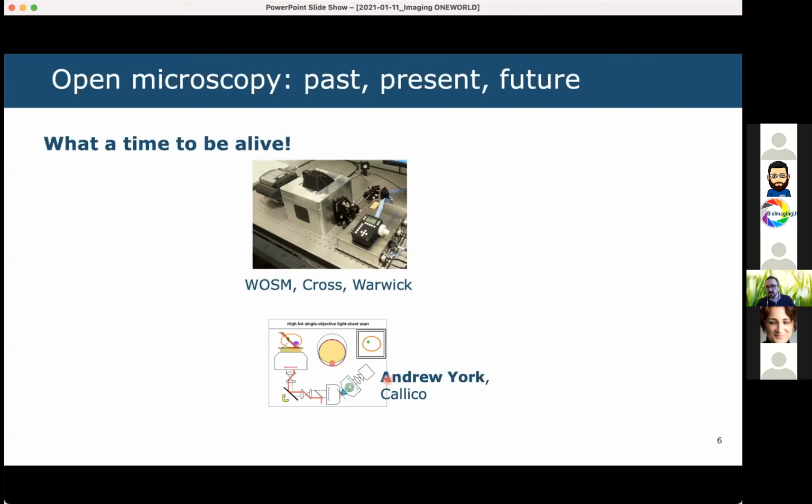who just had very radical ideas on how microscopy, and also how development for microscopy, should be publicized. He just said, okay, here's my website. I put all the information I have, and I even present you concepts, and I don't really care about publishing, but here are my ideas about new things that you can do with microscopy. He works a lot on single objective light sheet scanning microscopy, for example. So check that out. That's basically the main motivation for me at that time: can we make something which is as simple as possible and as open as possible?